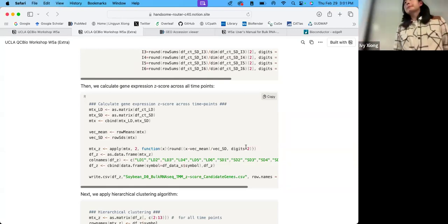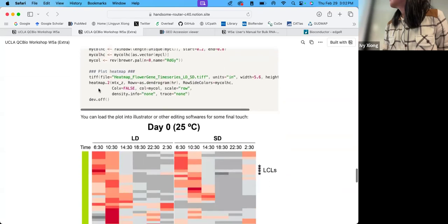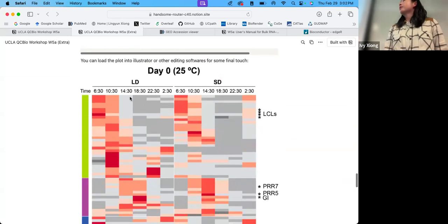I have a heat map, but it doesn't look like the things. Like the labels are missing. Like the general where the reds and grays are. Yeah, so you have to touch it up. I did it in Illustrator. It doesn't look like, you know, I don't have all that green. Yeah, it's smaller. I have like two types of green like this.